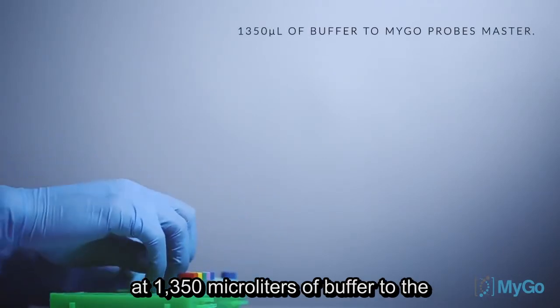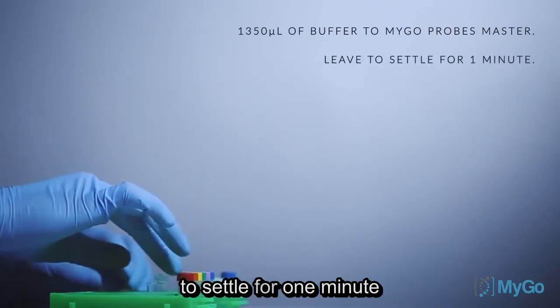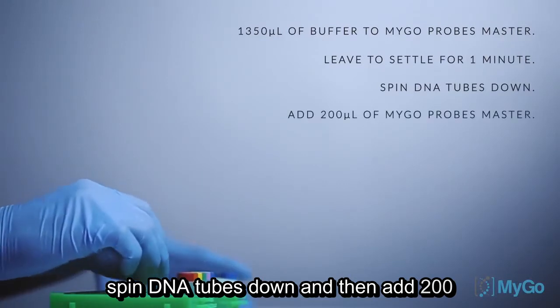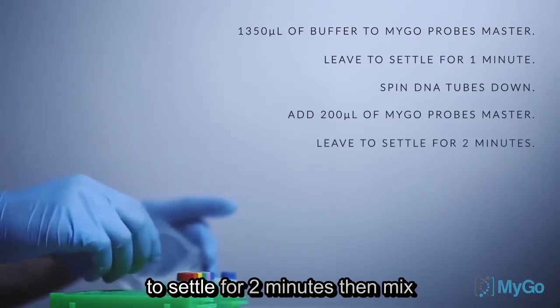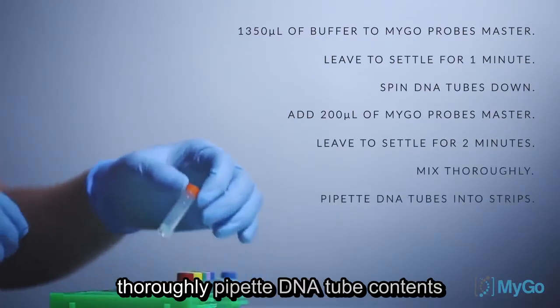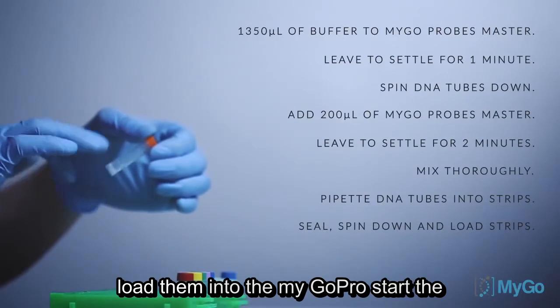Add 1,350 microliters of buffer to the vial of MYGO Probe's master, and leave it to settle for 1 minute. Spin DNA tubes down, and then add 200 microliters of MYGO Probe's master. Leave to settle for 2 minutes, then mix thoroughly. Pipette DNA tube contents into MYGO 8-well strips, seal the strips, then spin down the strips, and load them into the MYGO Pro.